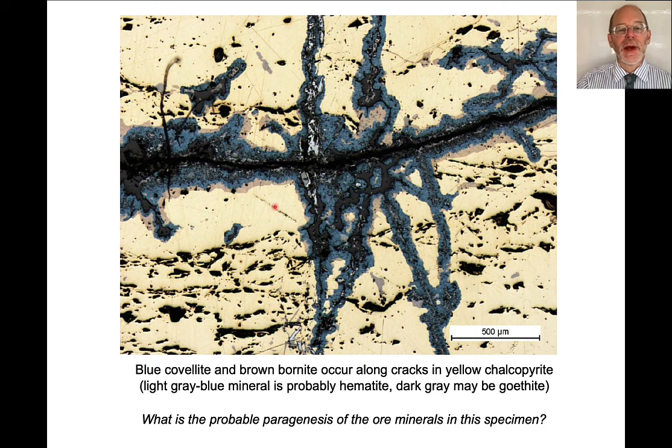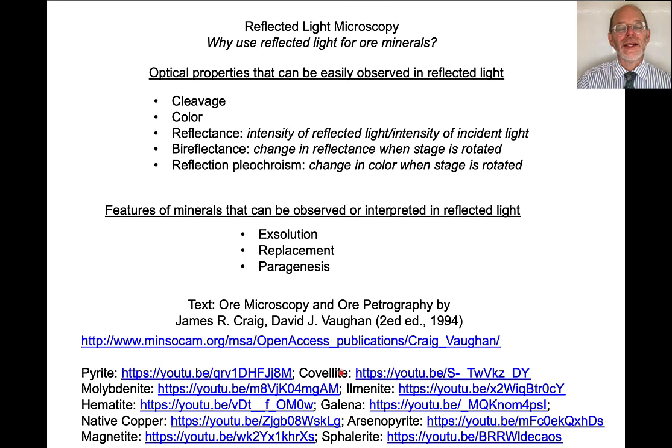So that finishes my discussion of reflected light microscopy. I do recommend looking at these online resources. They really are quite good for illustrating just how reflected light microscopy works and how it can be used for interpreting ore paragenesis. Thanks.